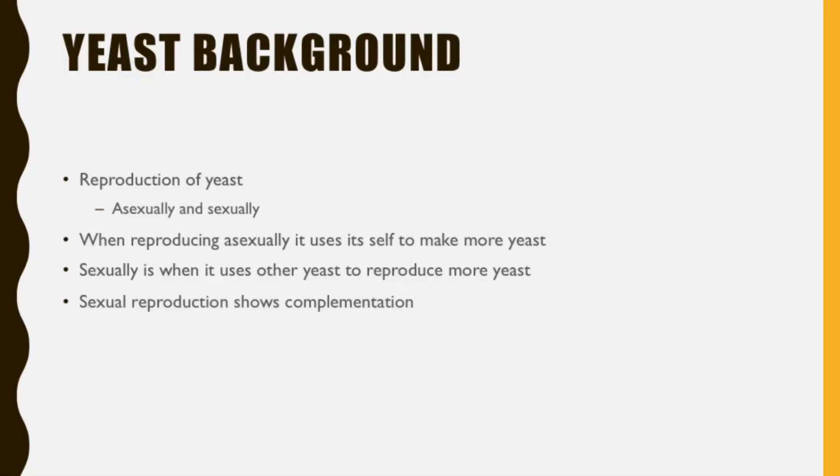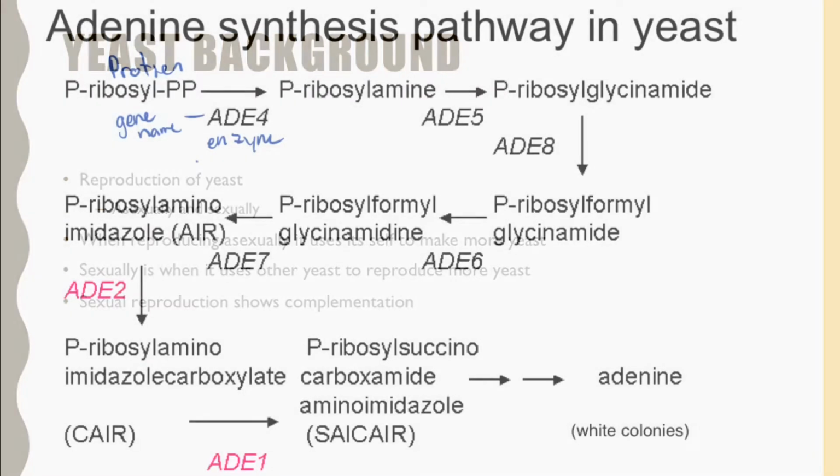Just a little background on yeast. It reproduces asexually and sexually. For this experiment, we need to focus on the sexual reproduction to actually show the complementation between the different yeasts.